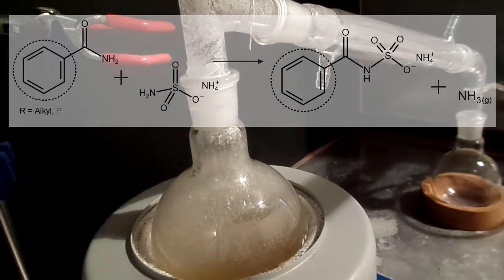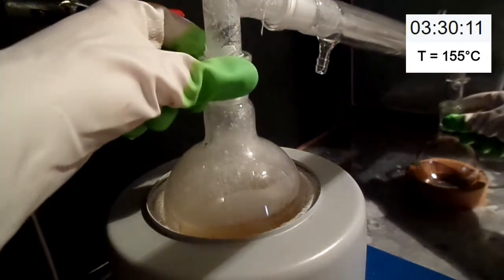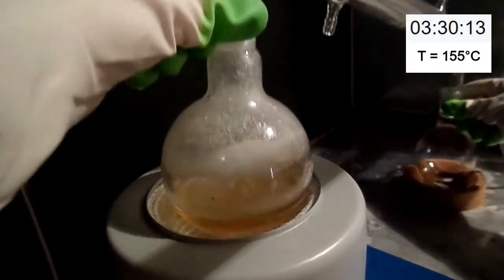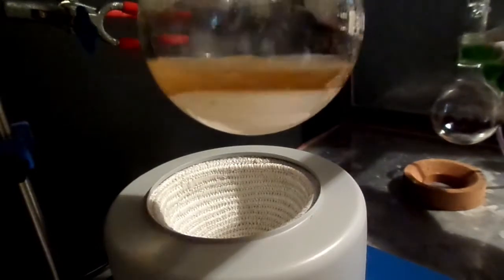This reaction is reported to work for both primary alkyl amides such as acetamide as well as aromatic amides. I lifted the flask at 3 hours and 30 minutes into the reaction and we can see the presence of some insoluble solids in the flask, which I believe to be the intermediate product. Both benzamide and ammonium sulfamate should have been molten by this stage.